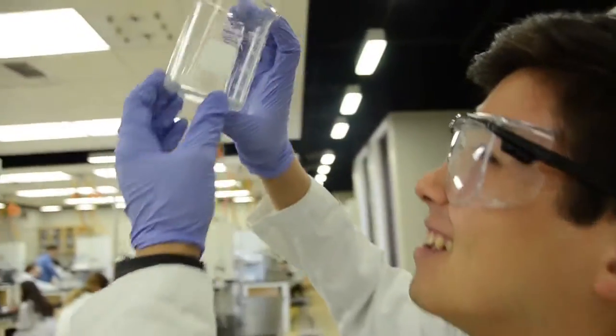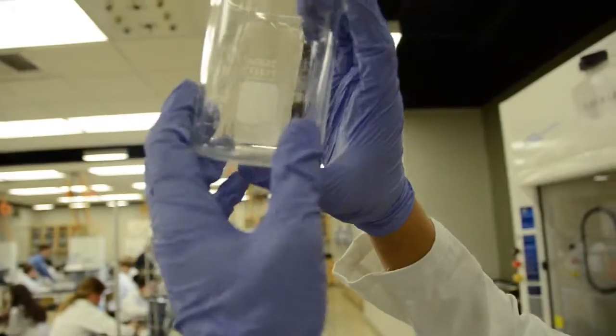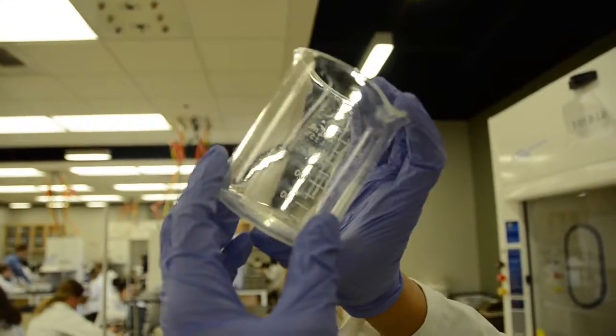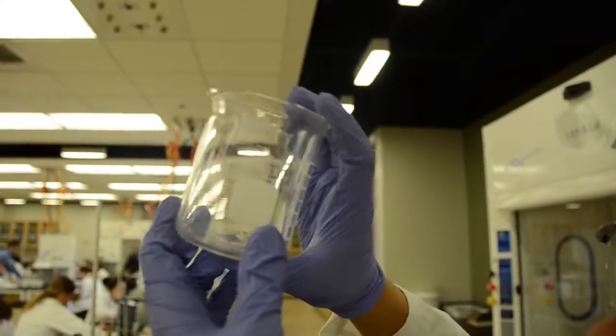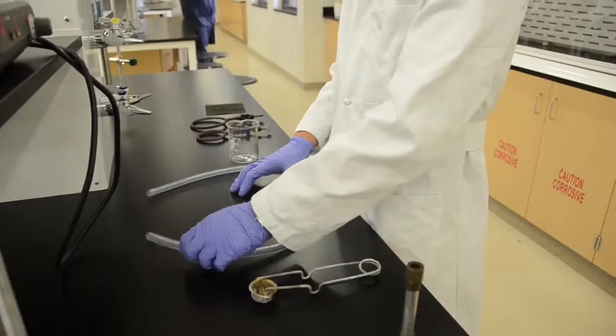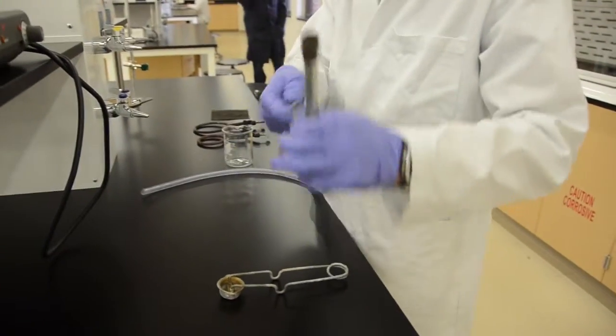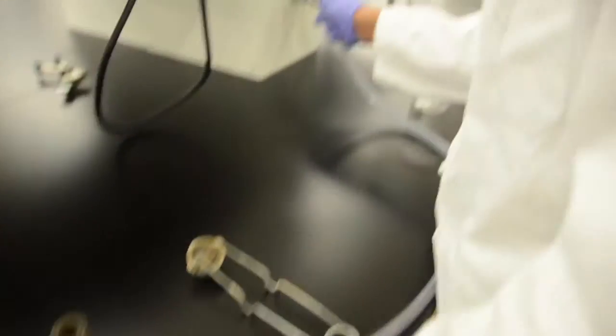Before doing anything else, make sure that you inspect all of your equipment, especially any glassware for cracks or chips. When glass is heated, it expands which will place stress on any cracks possibly breaking the beaker completely. Once you have ensured the safety of all equipment, connect the gas tubing to the Bunsen burner and then to the gas source.